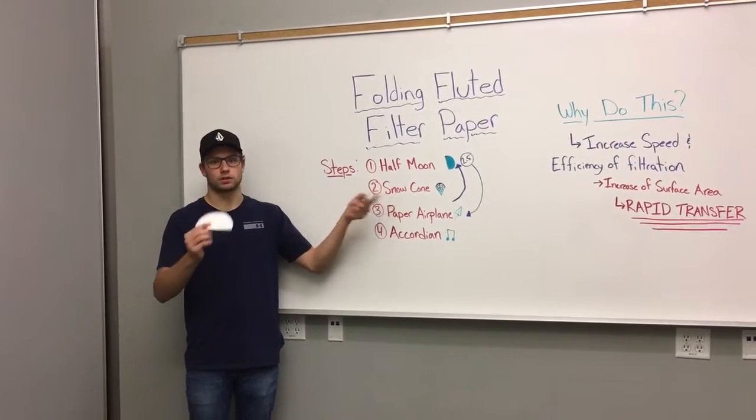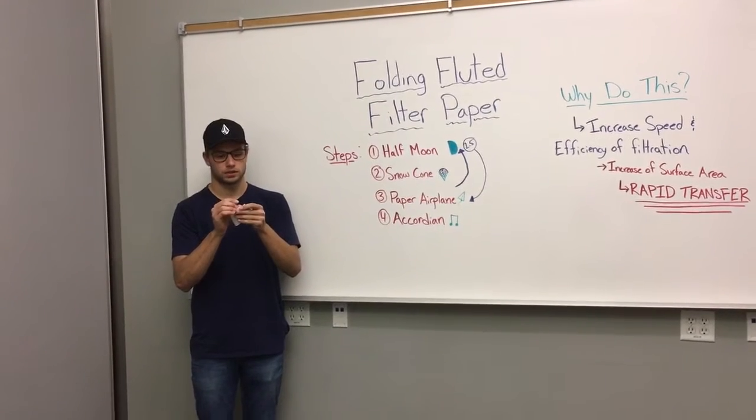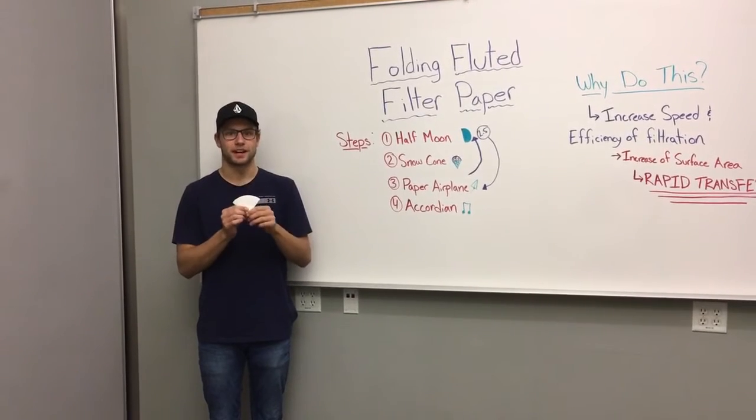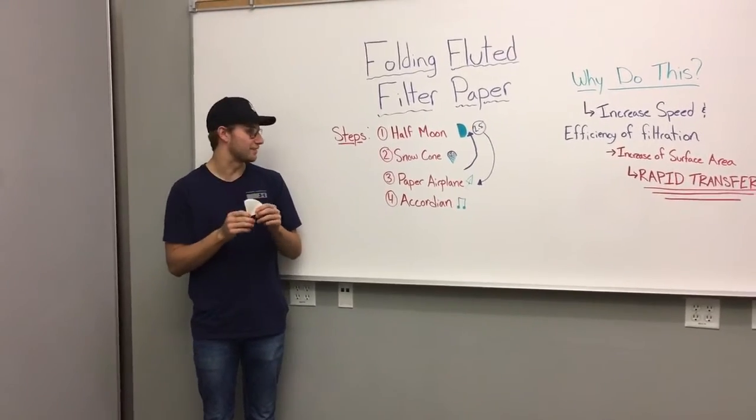Second step, we're gonna make a snow cone. So we're gonna take this half and fold it over again into quarters. It makes the shape of a snow cone. Be careful when you do this in the lab — you're not allowed to eat snow cones in the lab. Not safe.